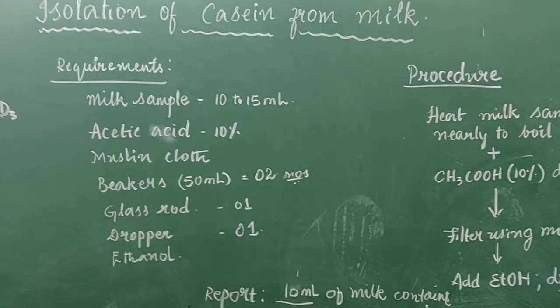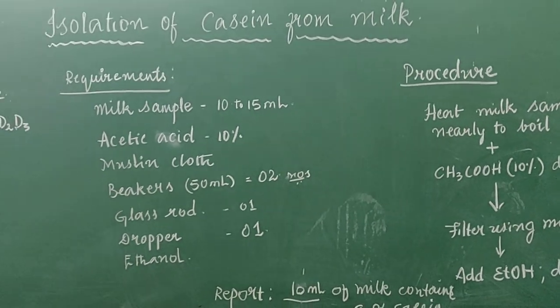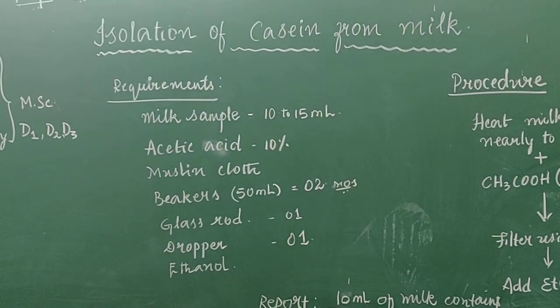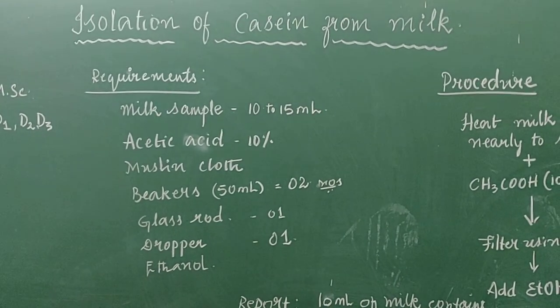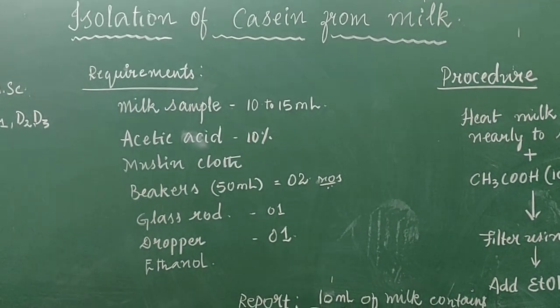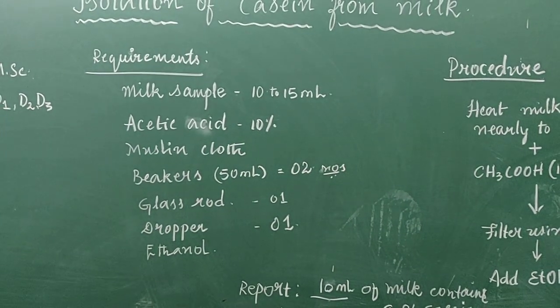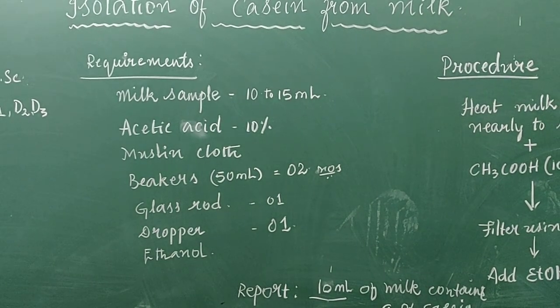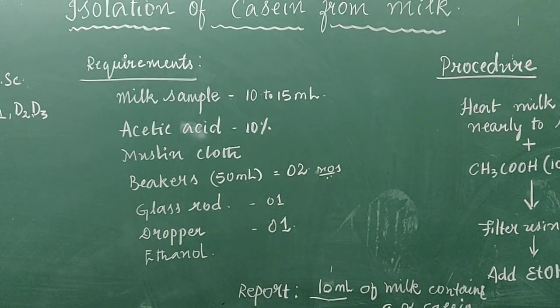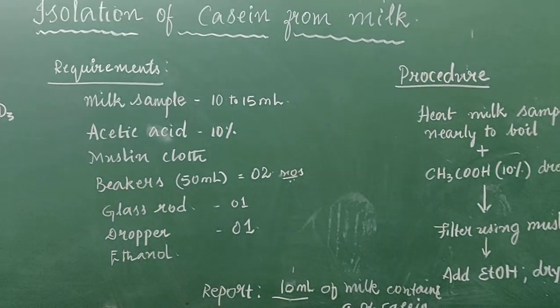The principle here is amino acids are the building blocks of any protein. Casein is a protein which is found in milk. We are going to play with the pH of milk. From neutral, we are going to make it acidic and we are going to precipitate out casein. More about the theory of this experiment shall be in the second video. Here I am going to only perform the experiment.